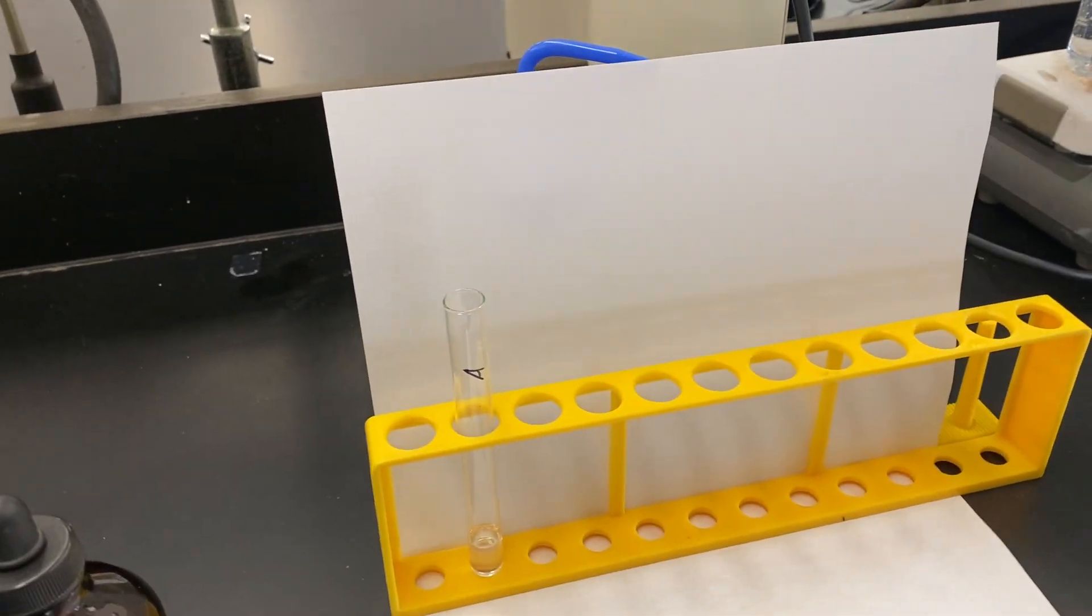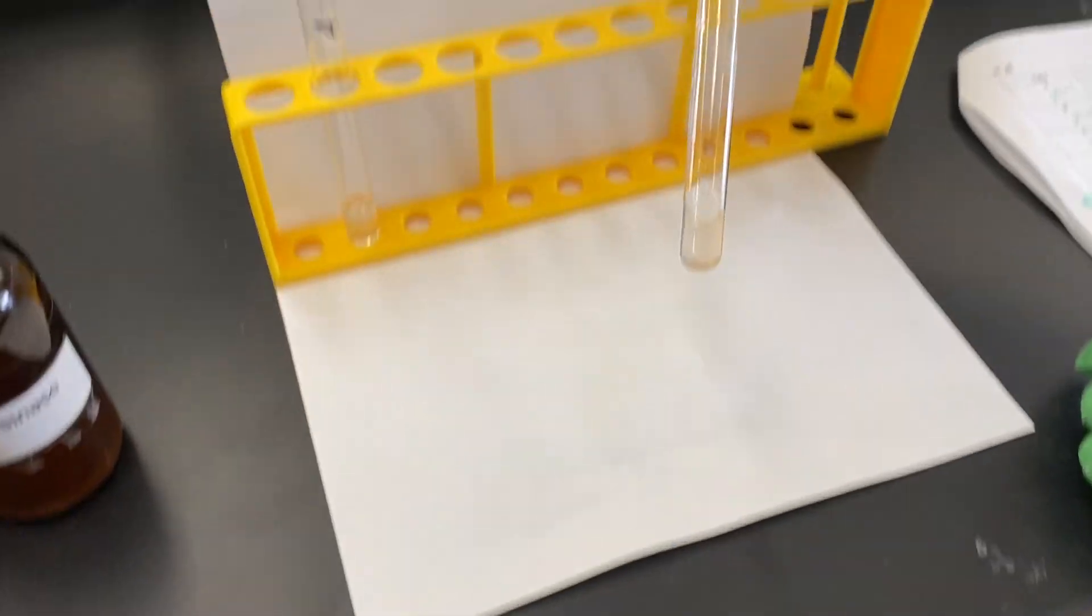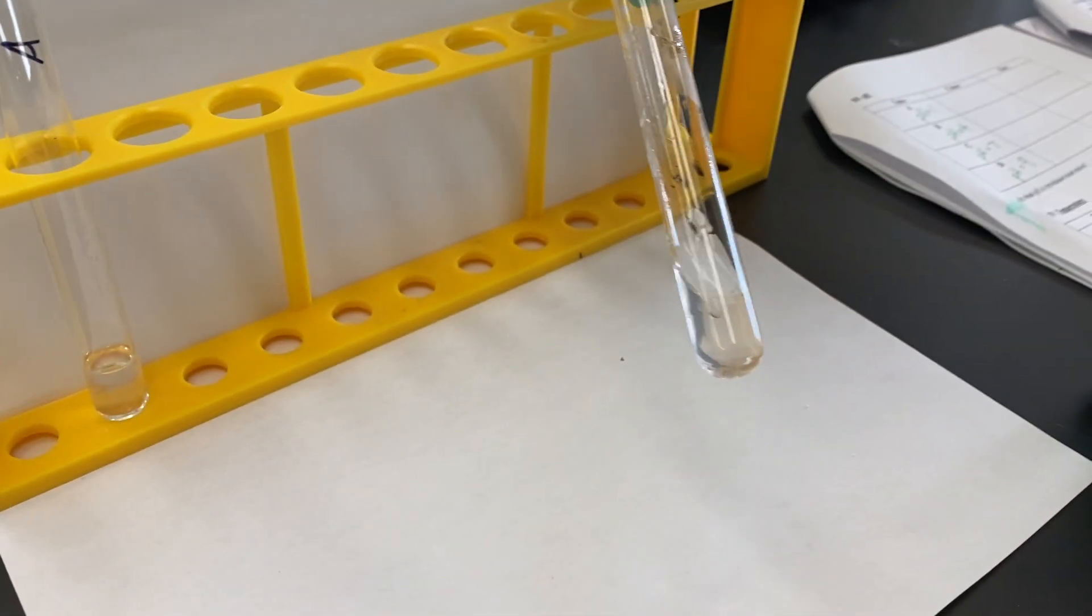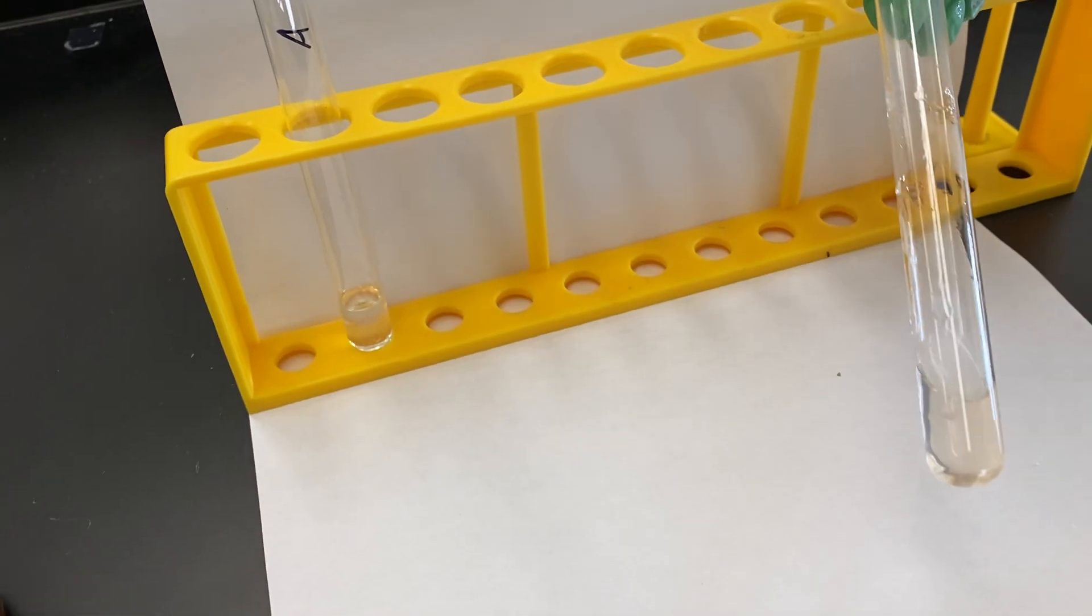If not, come with me. Test tube B. We're looking at pH 4. It's lactic acid. It has a light yellow tint, but really not much going on there. Maybe a little light yellow.